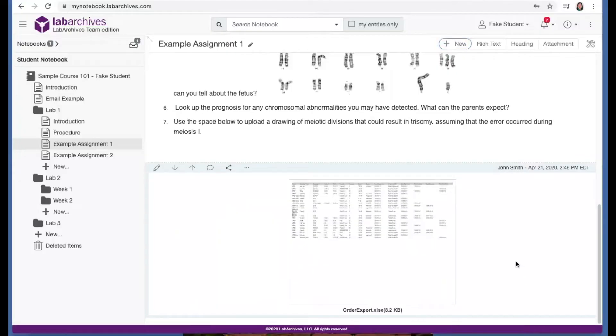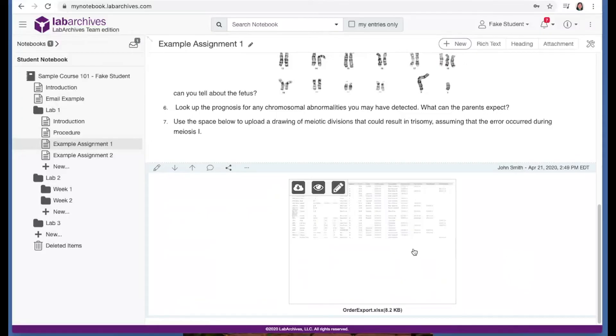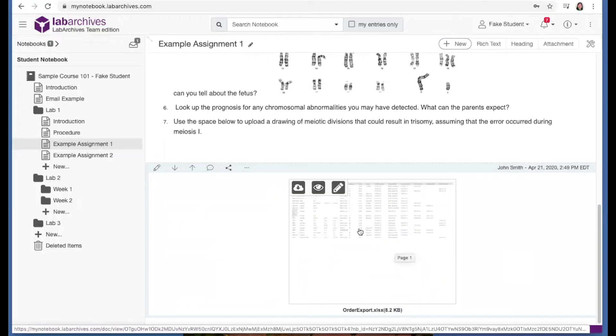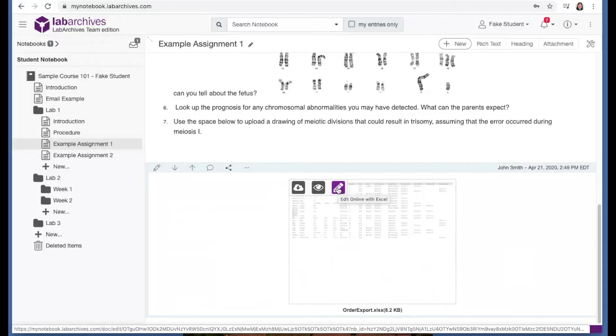Now LabArchives does include a PDF viewer, an image annotator, and you can even edit Office documents using our Office online. Just hover over any Office document and then click this pencil icon, which will open the document up in a new tab where you can make edits.